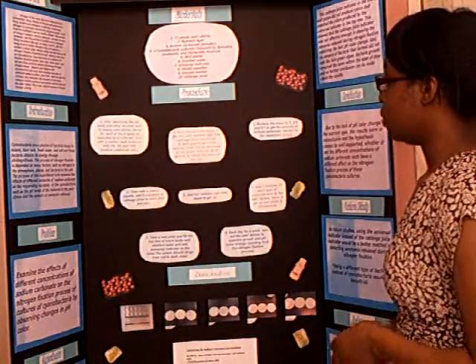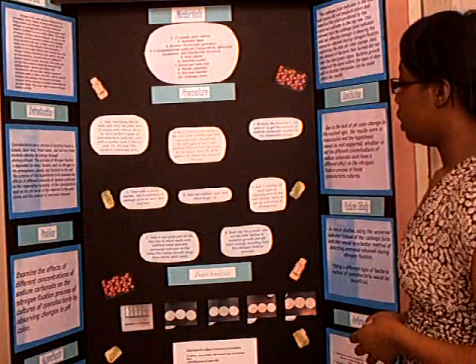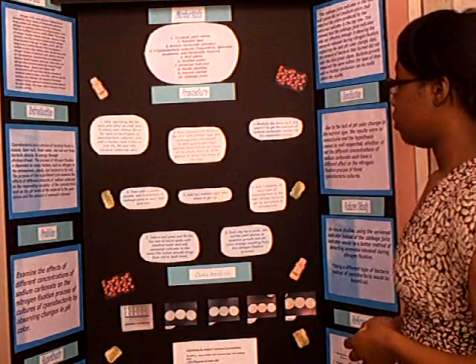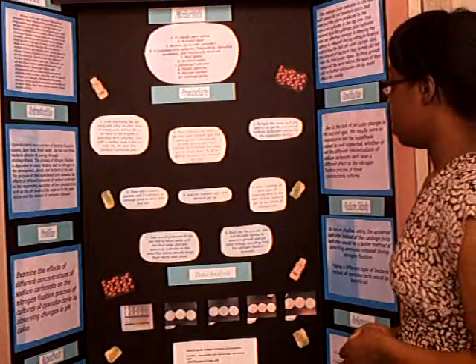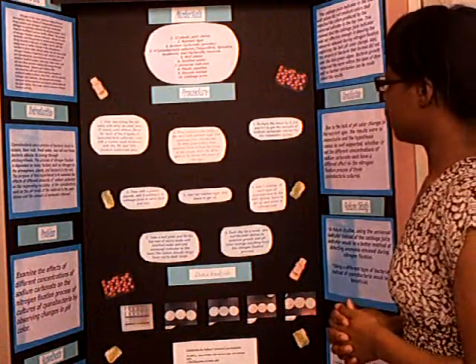it. I added hot nutrient agar and left it to gel up. Then I added 1 milliliter of each type of cyanobacteria to the petri dishes and left them to gel up, and I placed them in the climatarium under white light.